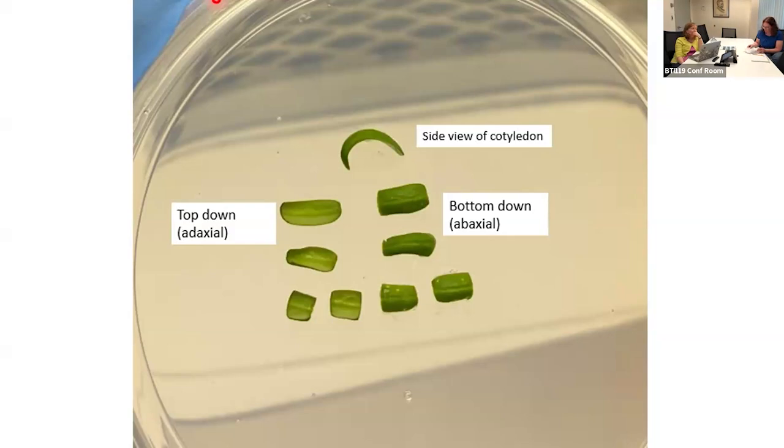In general, it should be in the protocol, but we keep our culture room at around 24 degrees, and some people are using incubators. When I first came here, they already had a big culture room in place, and that culture room is kept at 24 degrees, but it fluctuates 2 degrees either side when the lights come on or go off.